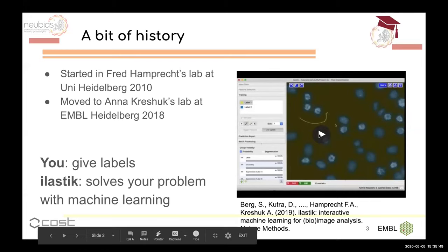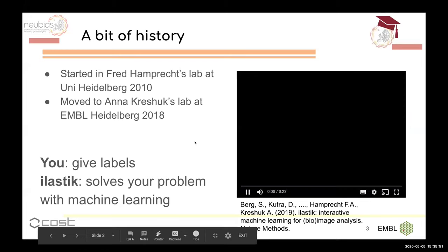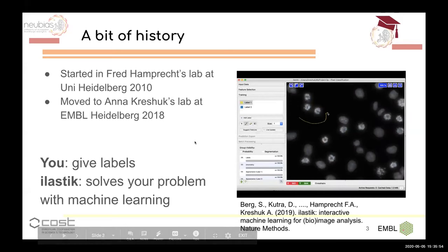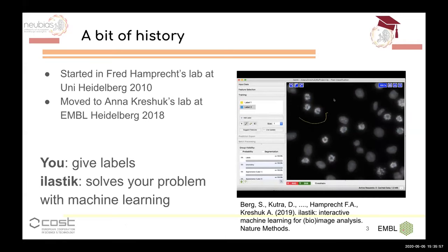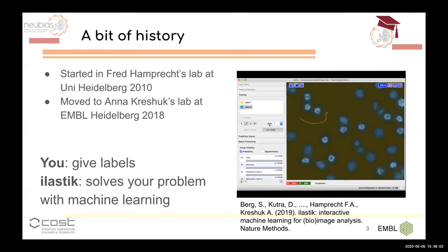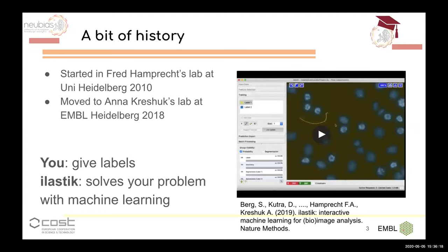You can see what pixel classification does — this is hopefully the workflow you already know. The same philosophy used for pixel classification goes through all the Elastic workflows: you give labels because you know what you're looking for in the data, and we do the algorithmic side — given your labels, we solve the problem with machine learning algorithms. On pixel classification you give labels for pixels.